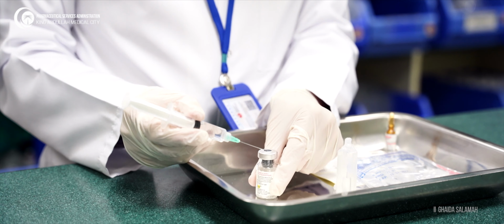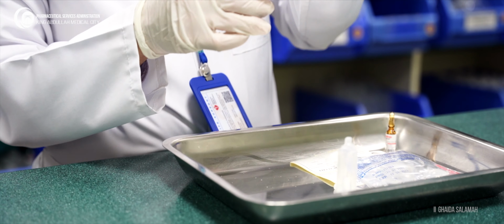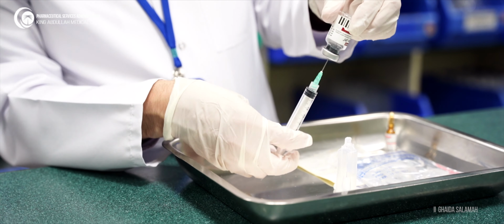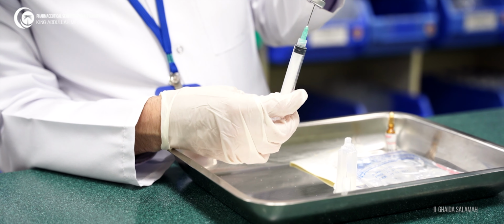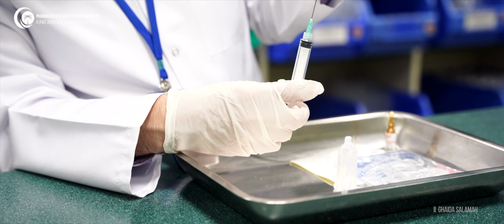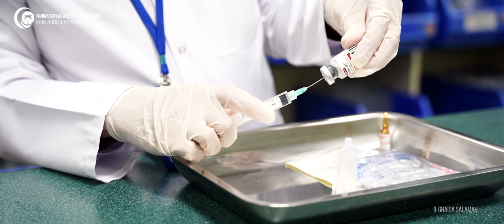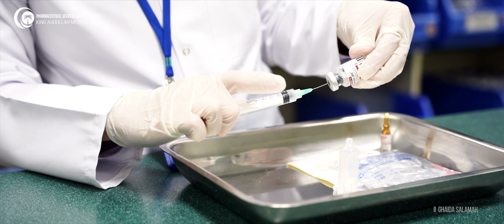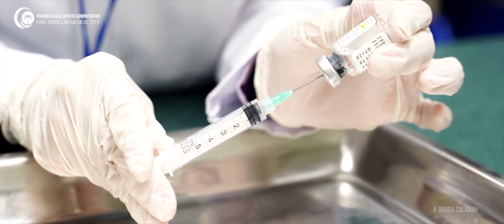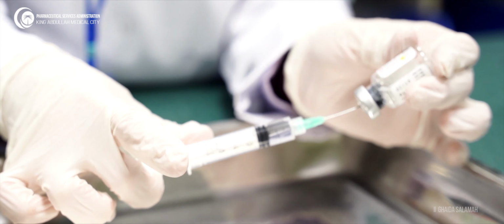Then using the non-coring technique, with 45-degree insertion of the needle into the septum, dissolve the powder, then withdraw the dissolved or reconstituted solution, and make sure that the needle is down to the neck of the vial to make sure it will take all the volume. Also, while you withdraw, avoid touching the plunger. Make sure the needle is at the level of the neck.